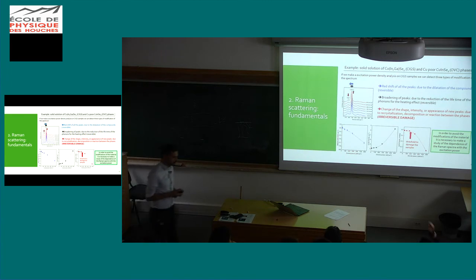What's the influence of the laser power on the measurement accuracy? The influence of the laser power on the measurement, not on the material? The measurement doesn't have any influence at all, unless you start to burn your optics. So you have to take care of your optic elements, because if you increase the power of your laser a lot, you can really destroy your optic components.